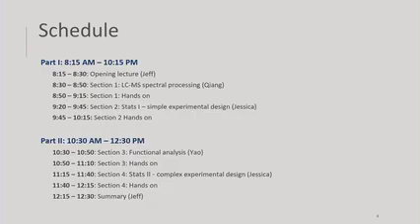After that is statistical analysis. Statistical analysis is very heavily used. This section is the older statistical material, but we comment on key concepts, because if you're new to MetaboAnalyst, you definitely need to use this statistical module. So we're going to emphasize the tips and procedures, followed by about 20 minutes of hands-on.